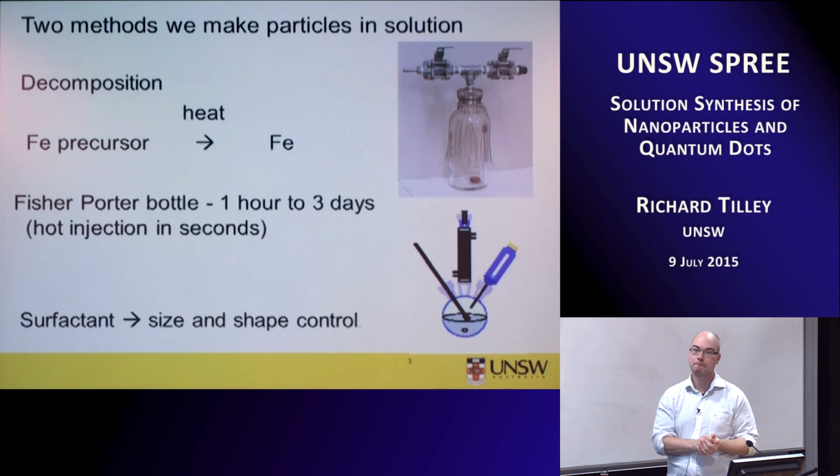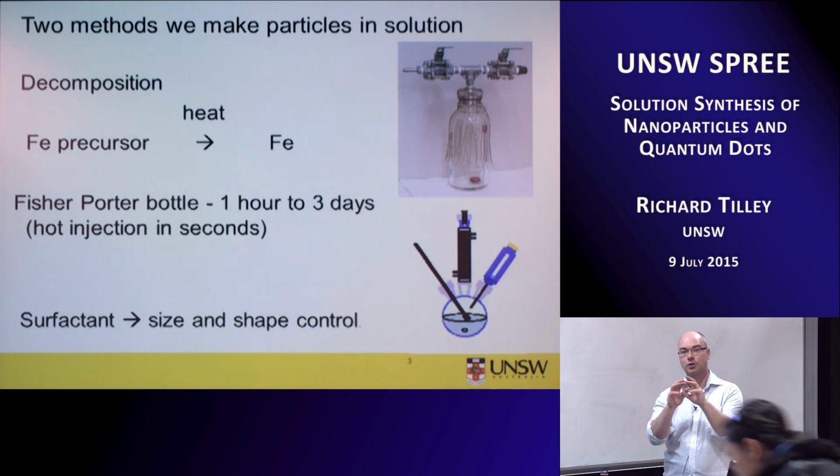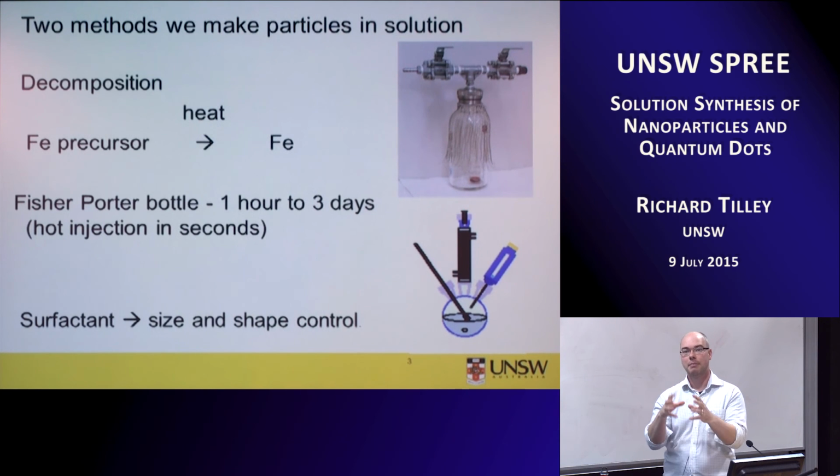Yeah. That's just for metals, it's not for silicon nanoparticles? This is typically for metals. For the silicon, we typically make it in a different kind of system these days. The silicon is pretty easy to make. It is all about making sure you get that passivation at the end. Making the dots themselves is not too challenging. It's actually making sure you get the capping right so that they're passivated after the reaction.